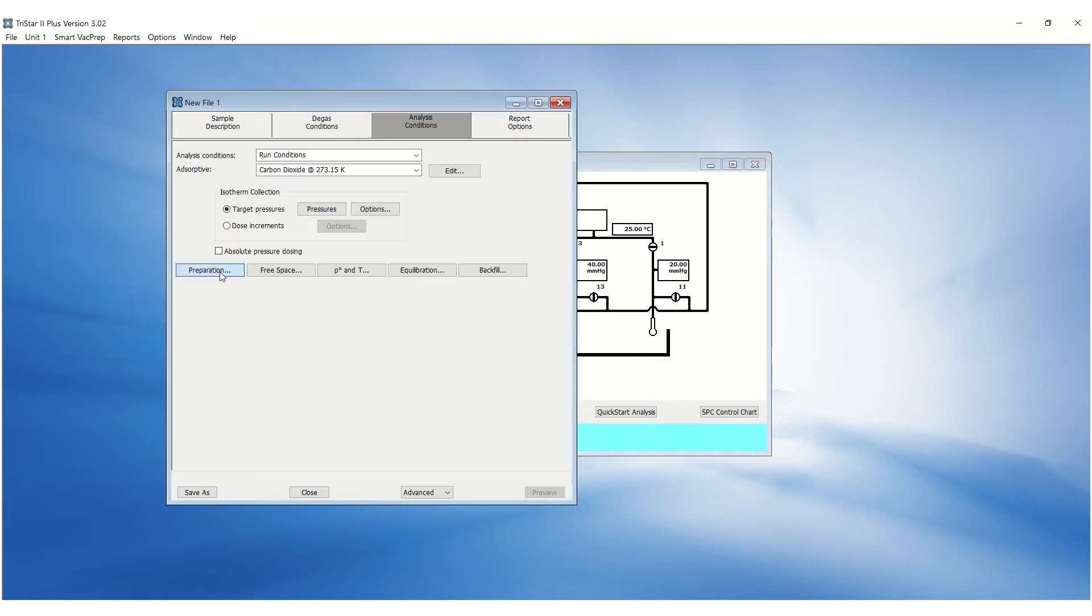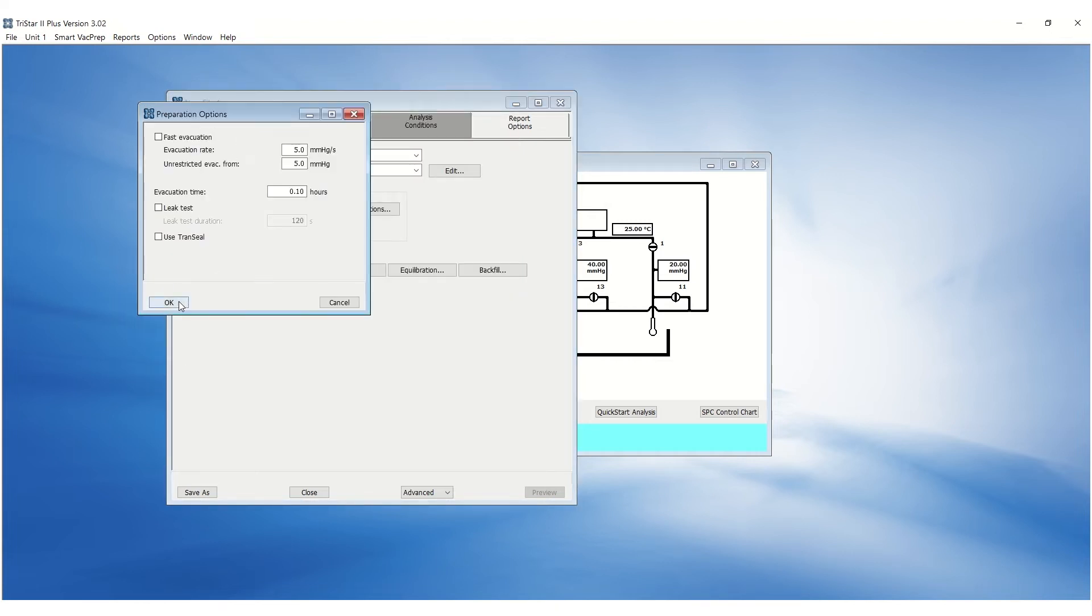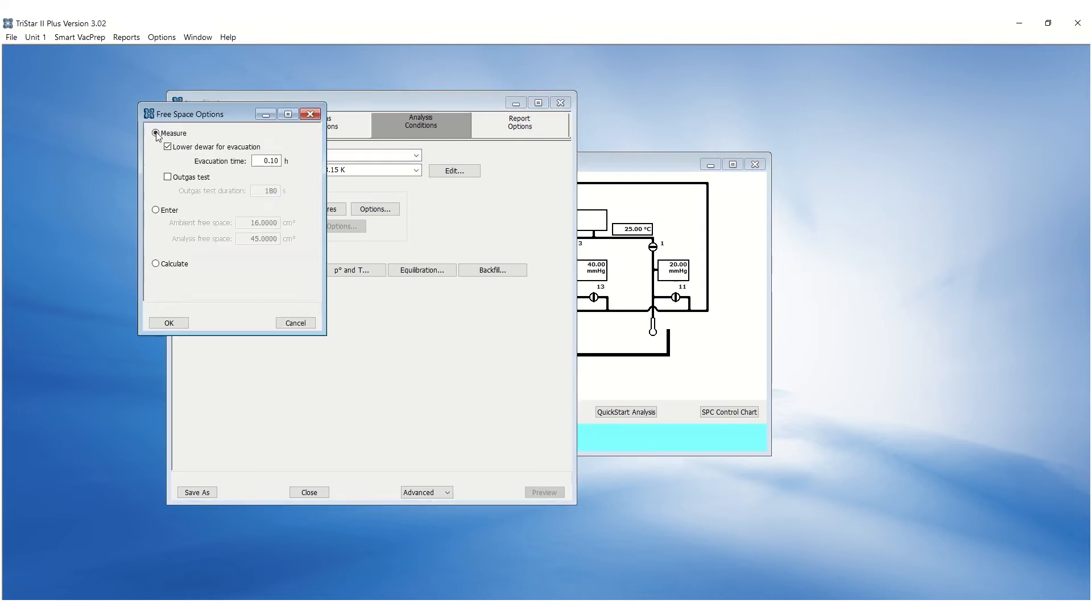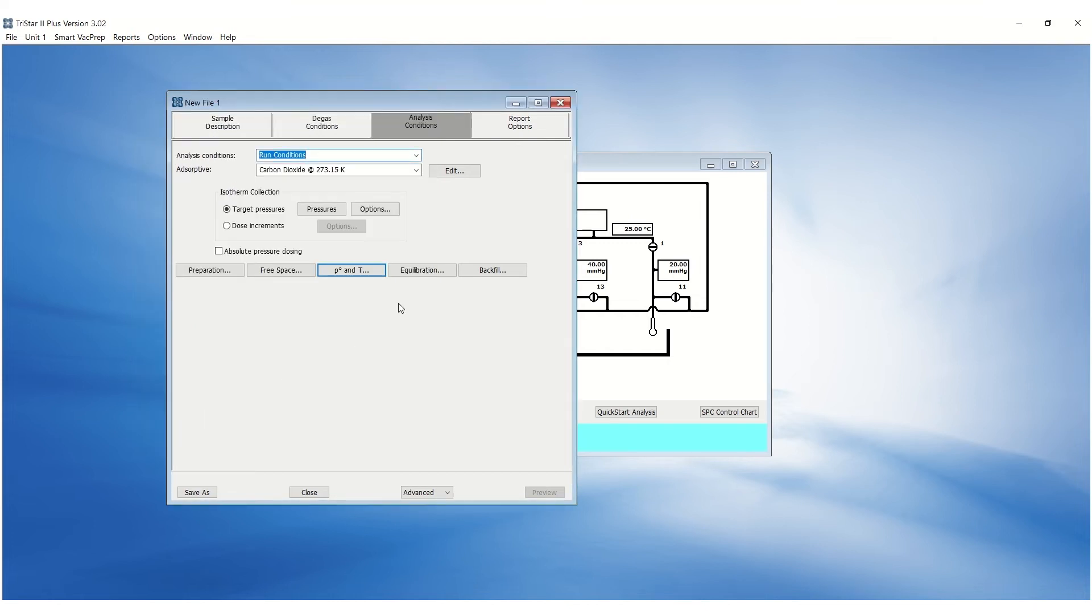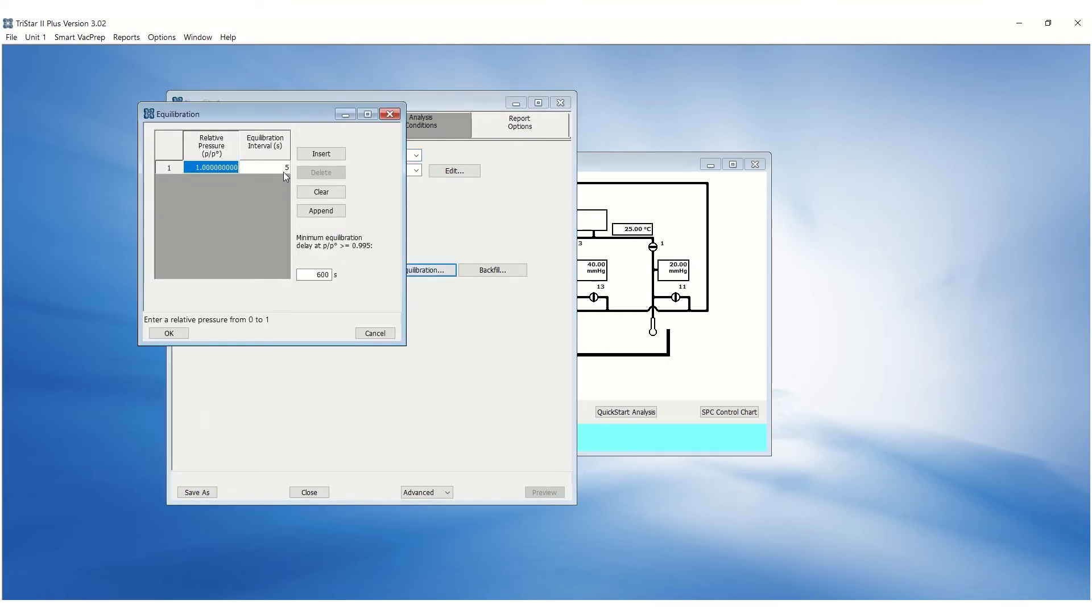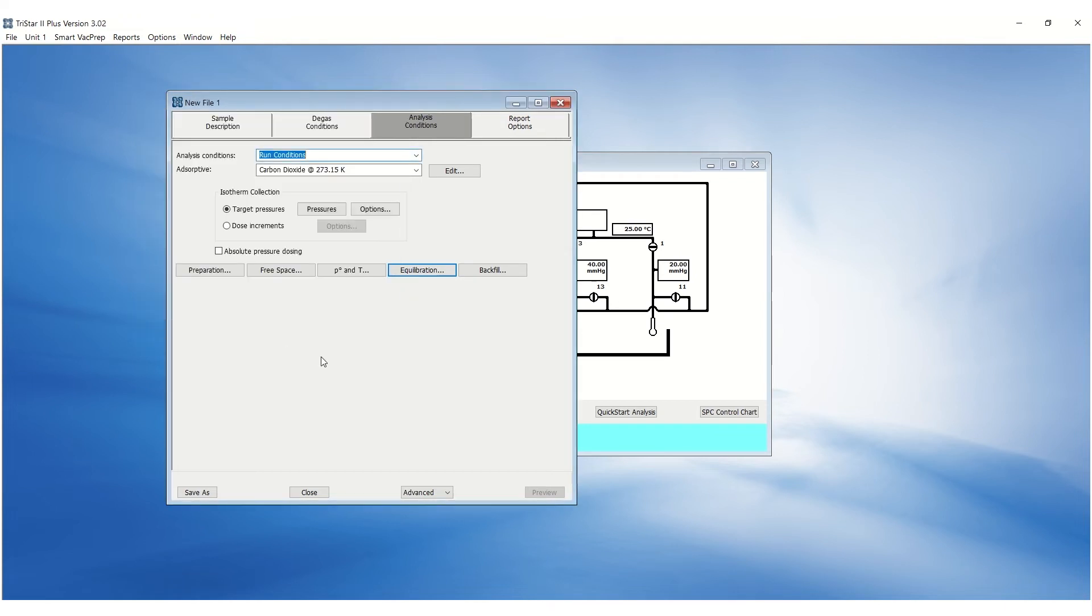Generally, the preparation options can be left as default. Select measure free space. Select calculate P0 and enter the bath temperature as 273.15. Set the equilibrium intervals as 10 seconds. These parameters are highly sample dependent.